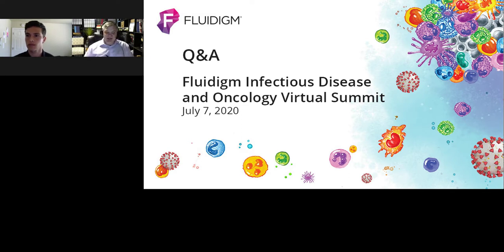And also one thing we didn't put a lot of focus on, just for the interest of time, is that when you're ready to get those results out, whether it needs to go out to PowerPoint, to PDF, or to high-resolution images, FCS Express has some very quick and easy export tools. So if you needed to export some of your t-SNE plots and some of that reported information to, say, PowerPoint, you can literally click a button and that data will be exported in whatever resolution you want.